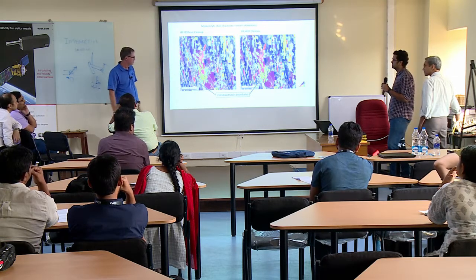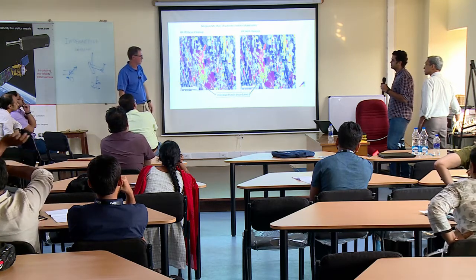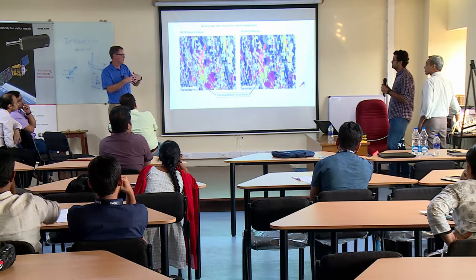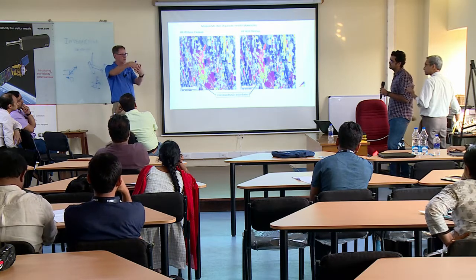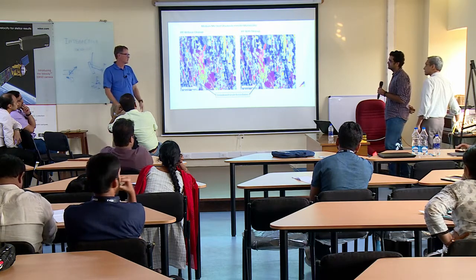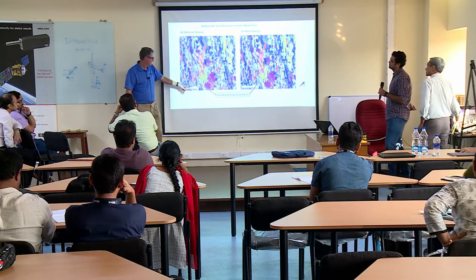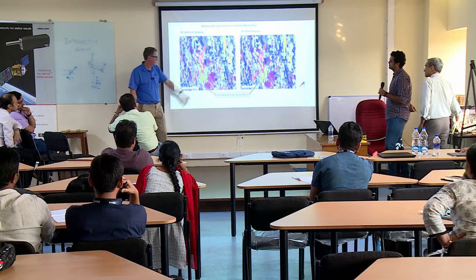But when I see it at a grain boundary like this, I don't get too upset because what's happening is the indexing is having a problem with two mixed patterns. For some reason, it's getting an intermediate. Instead of picking 1 and 2, it's picking some intermediate orientation. And so cleaning up that doesn't scare me a whole lot, but cleaning up this, yeah, that's scary. And I don't know what that is.